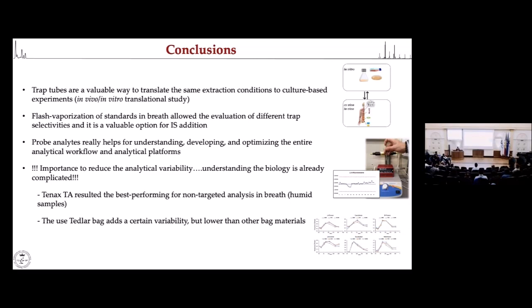Then we have seen that exploiting this flash vaporization allows us to generate replicates, and with replicates we can make more sense of our experiments. We can simulate samples, but it can also be used for internal standard addition. And the use of probe analytes really helps the understanding, the development and optimization of the entire analytical workflow and also of the analytical platforms used.